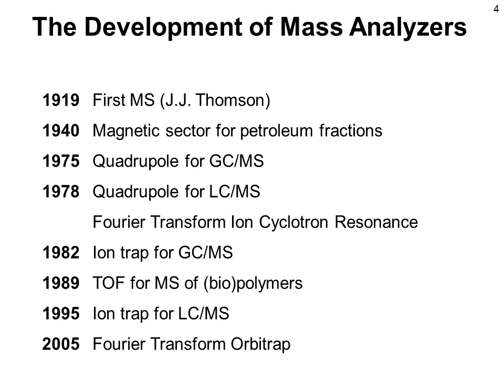Only briefly afterwards, the first couplings of liquid chromatography to mass spectrometry were realized. This was much more difficult, as ions had to be transported from the liquid phase to the gas phase and then into a high vacuum. We will hear later on more about the challenges of coupling liquid chromatography to mass spectrometry.